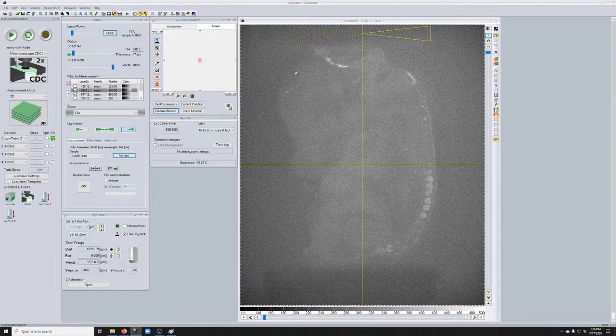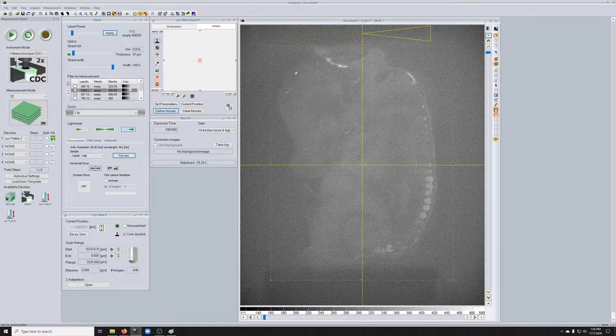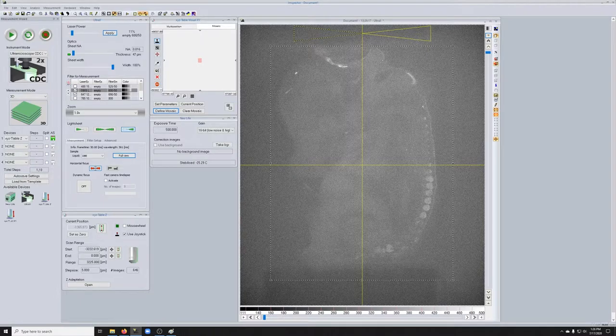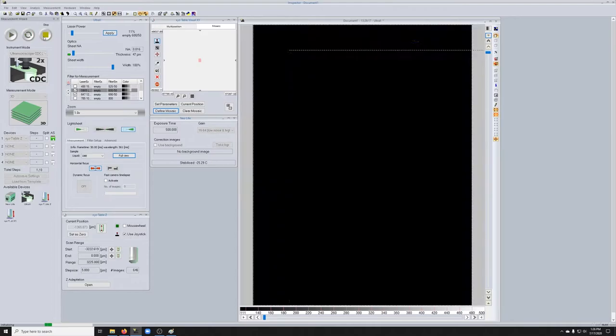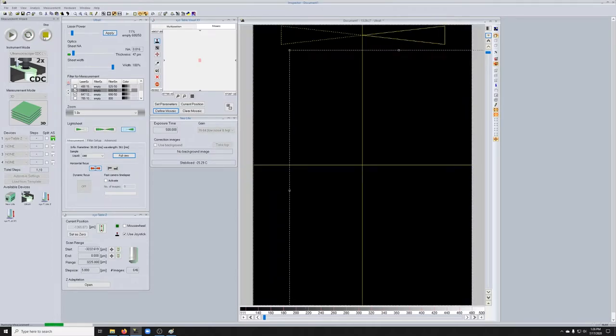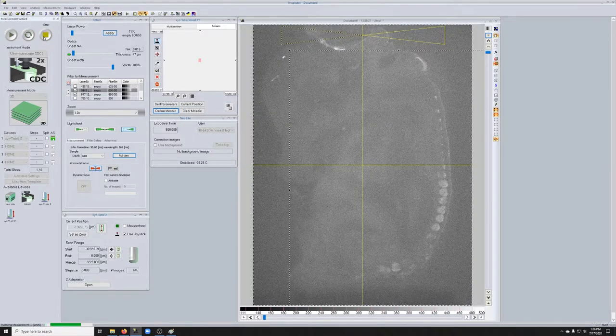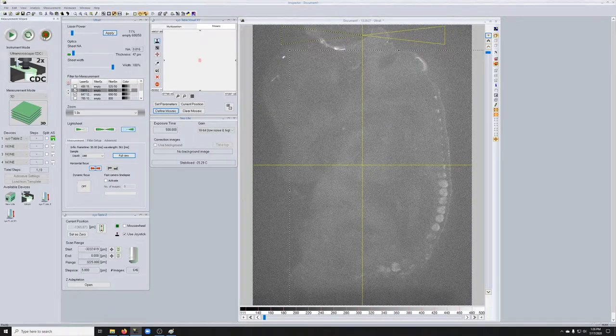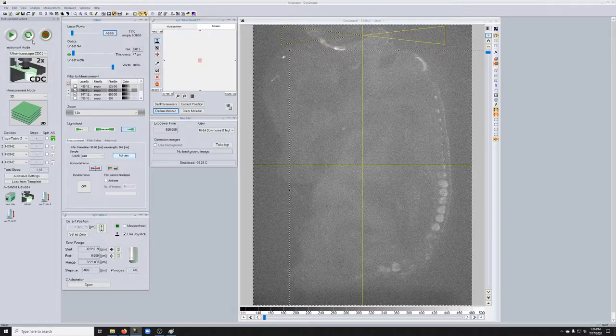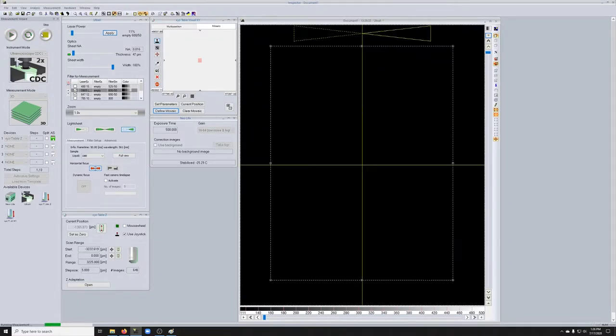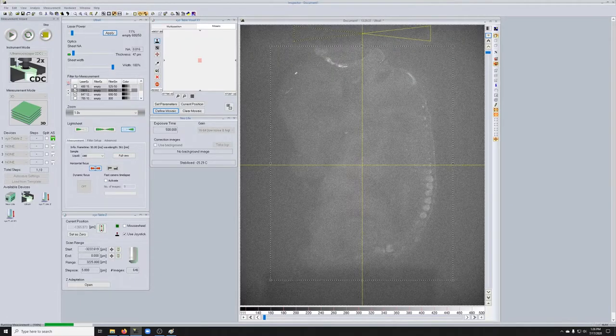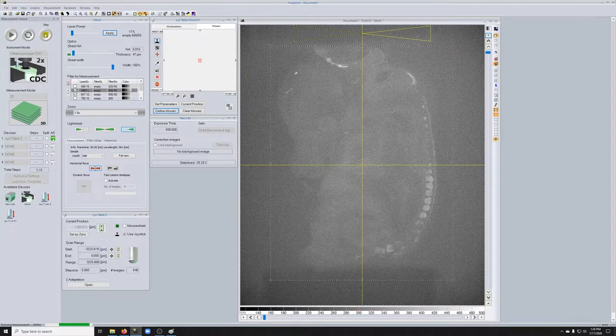So again, to crop, you draw a region of interest and you click this button. To uncrop, you click on full view. And you need to stop and start the imaging when you want to do that.